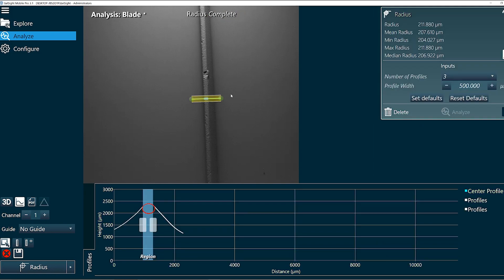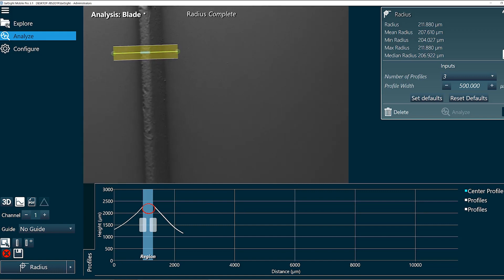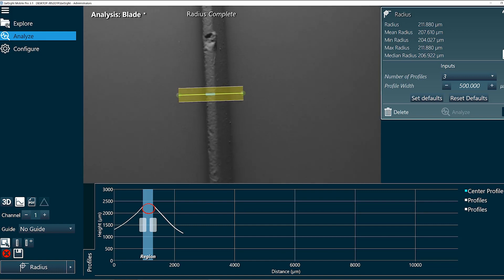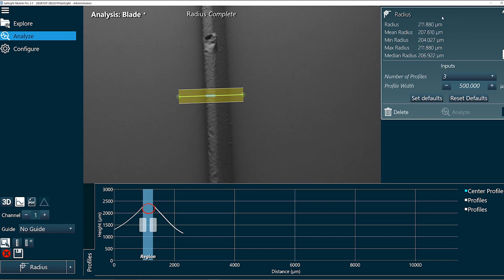Here I can see on my image I have three profile lines now. We'll zoom in there. And my top right corner shows the radius, the mean, the min, the max, and the median.